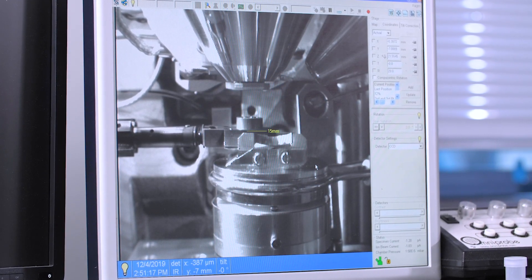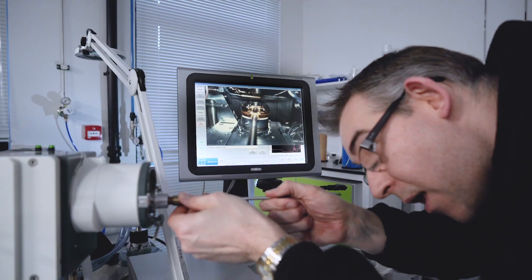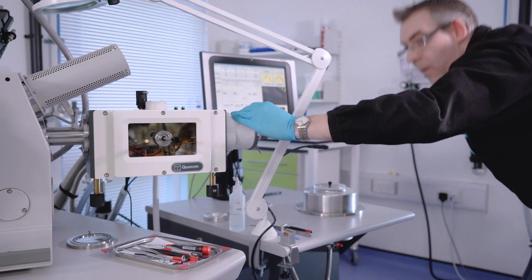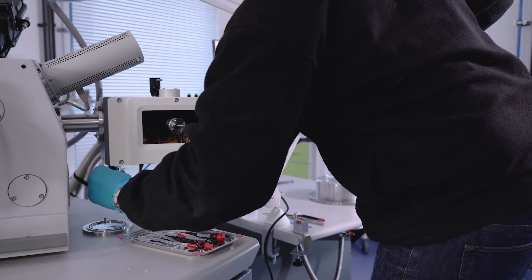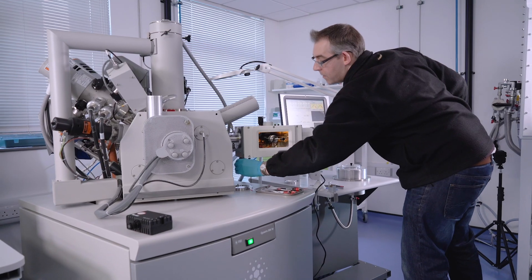Now once the sample is on the cold stage, we retract the transfer rod and close the SEM valve, and we're now ready to start imaging the sample.